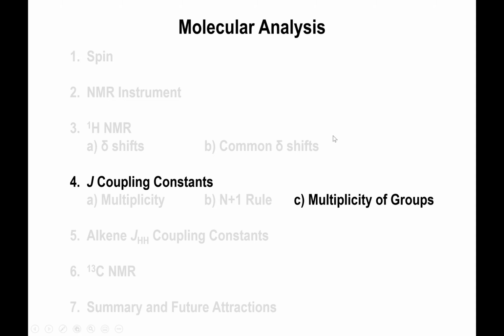Okay, so far we've talked about where the signals in the NMR spectrum will appear based on the functional groups that you're dealing with, the type of oxidation states of the carbons to which those hydrogens are bound. But now we're going to start thinking about some combo of type of splitting peaks that may show up in the spectrum that together can be utilized to figure out whether you have ethyl groups, isopropyl groups, tert-butyl groups present in your molecule. And this will help you simplify the process of molecular identification a little bit more.